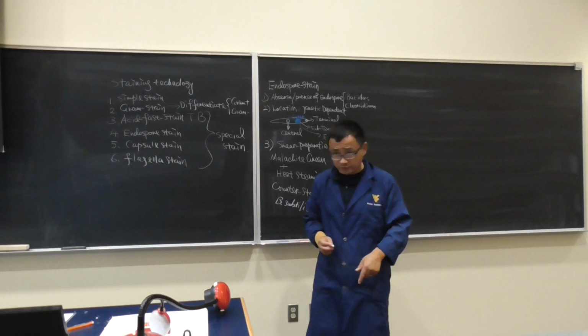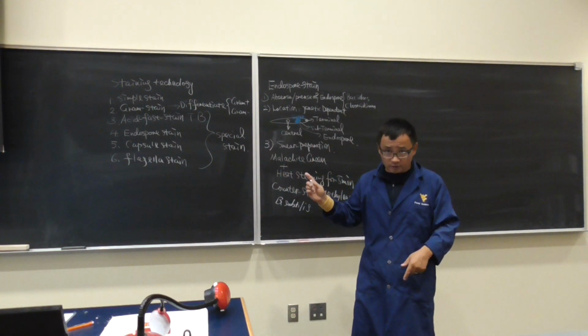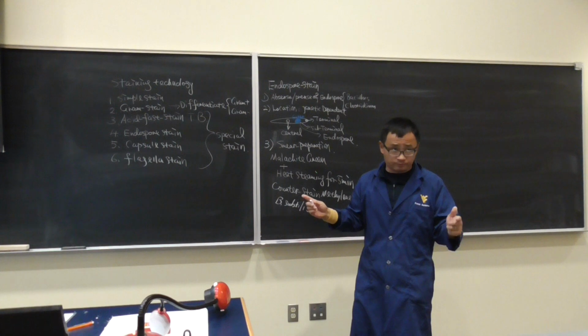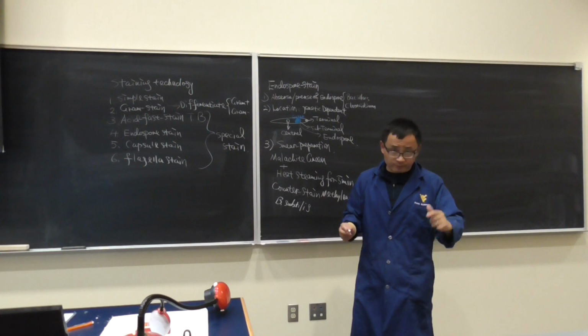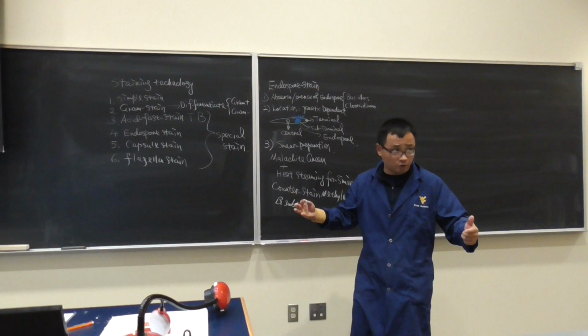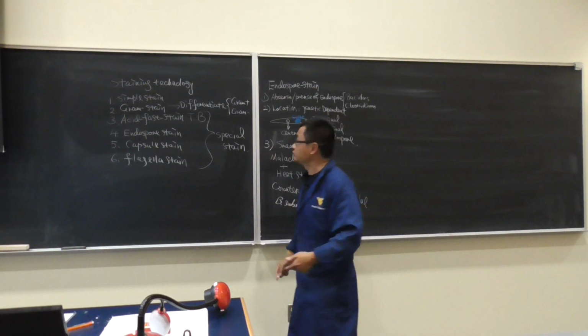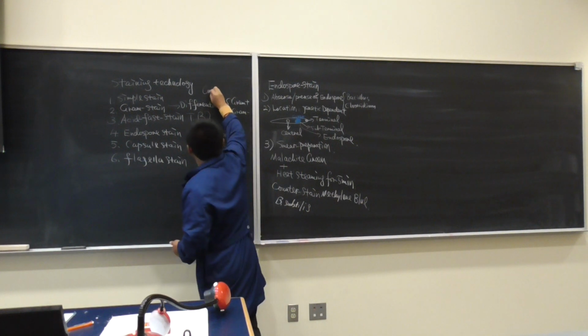This is a major difference compared to the gram stain. We mentioned the gram stain is focused on the cell wall structure, so we need to make sure the peptidoglycan is complete. If the peptidoglycan is already breaking down, let's say you're using a 72-hour-old culture, then it's all going to stain gram negative. We call it gram variable.